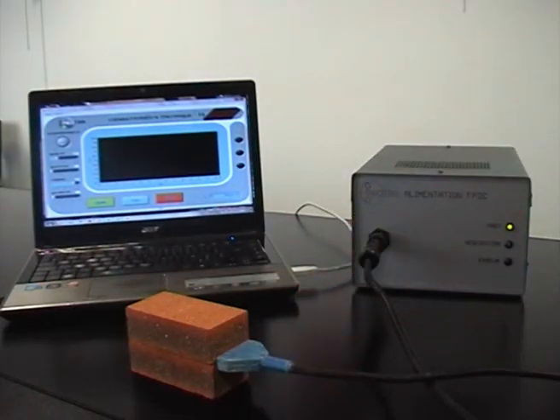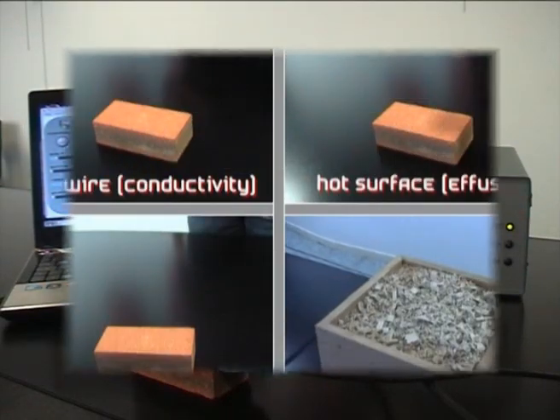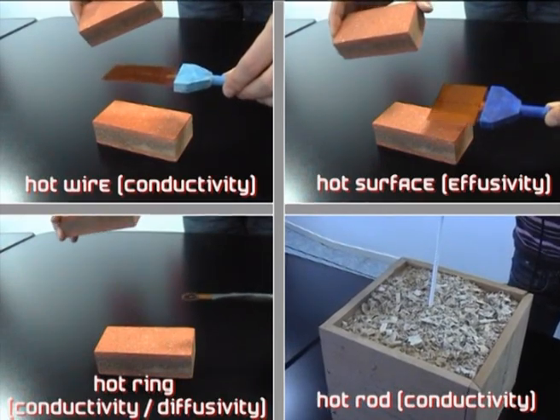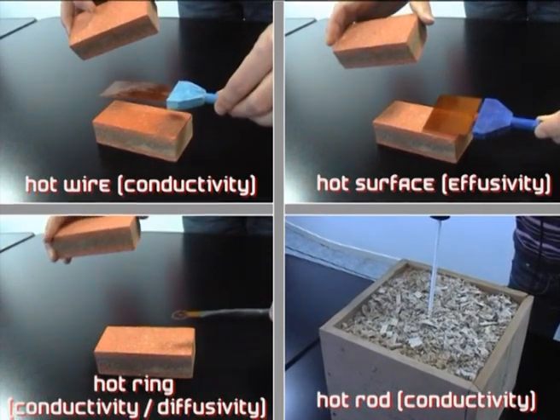The system includes an electronic module called power supply FP2C, a technical manual, a setup CD and one or several probes.